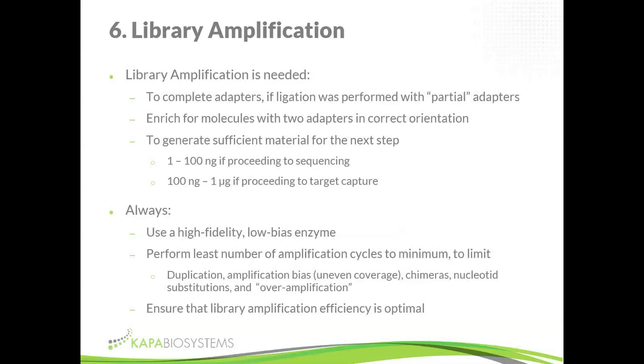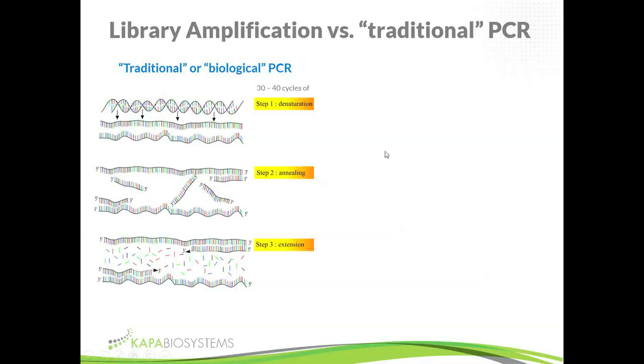And so I want to talk a little bit about this phenomenon of overamplification. To provide context for it, I want to step back and look at the difference between library amplification and traditional PCR. I referred to that a little earlier.